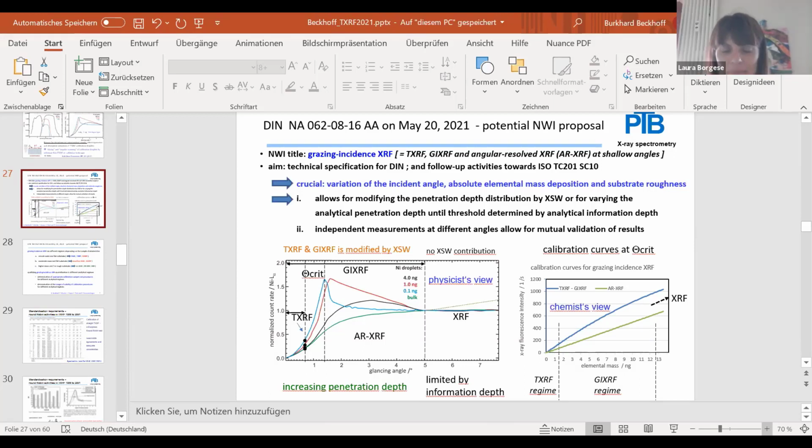So I think that it could be done. The main issue that we have is that if we provide this curve, we have to rely on the positioning of the sample inside the instrument, which with any commercial instrument available in the market, is not easy.